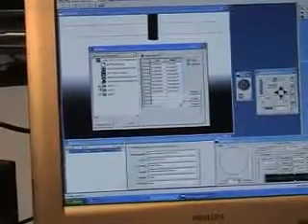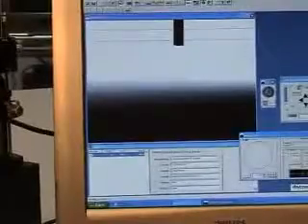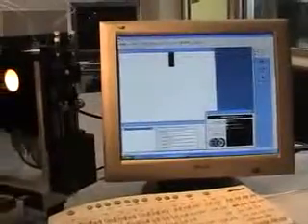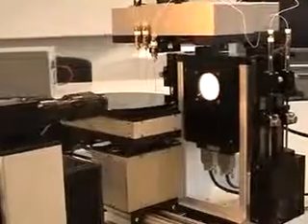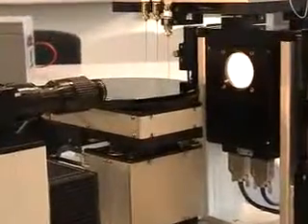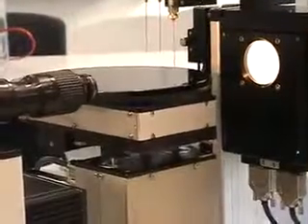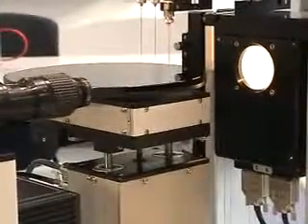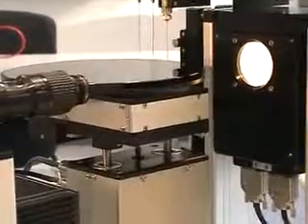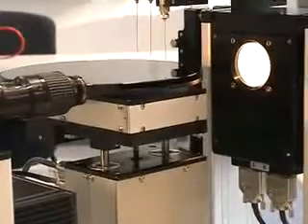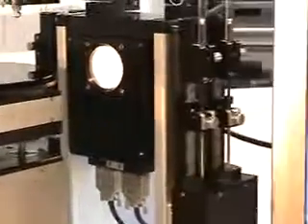We will start now automatically a measurement. So we just press OK and now the definition of the measurement will control our instrument. Sample stage and needles are moving automatically. We can position now the droplets and the measurement is performed.